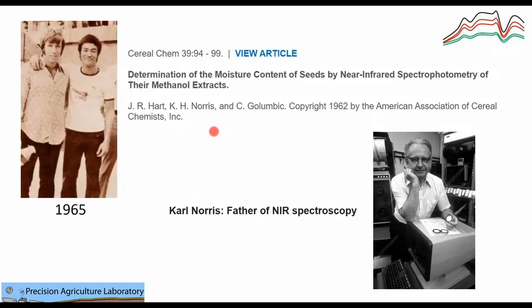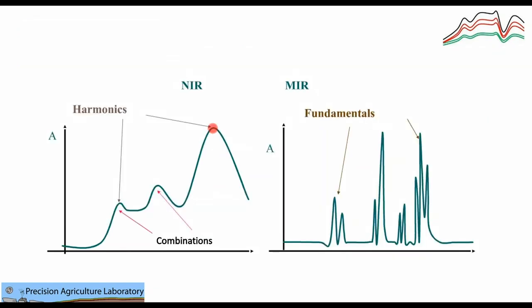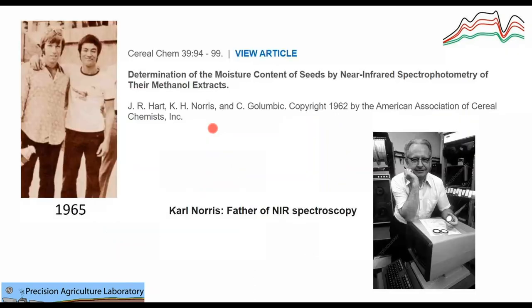And why is that? Because in near infrared spectroscopy, we need to analyze different peaks at the same time. So the computational power was small. It wasn't until the 60s, when we had the power of computing, that near infrared spectroscopy started to actually have some results.